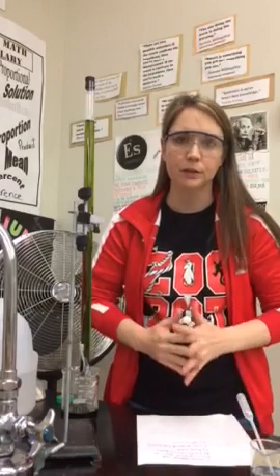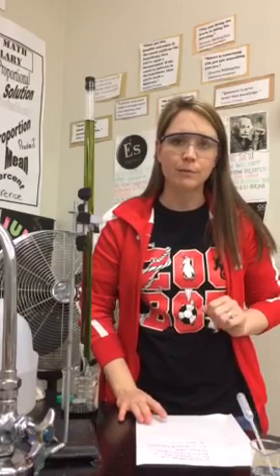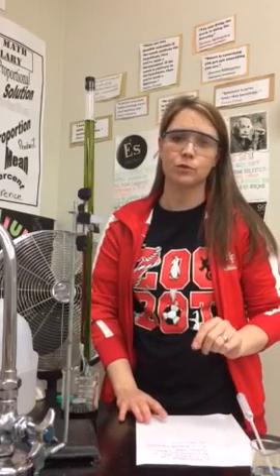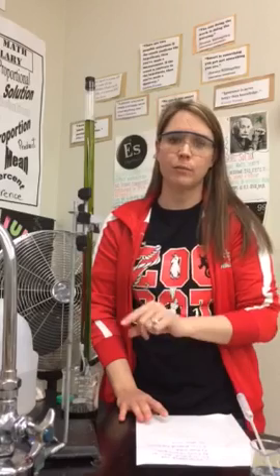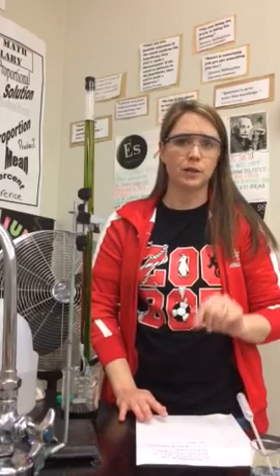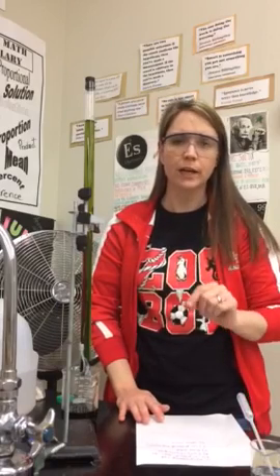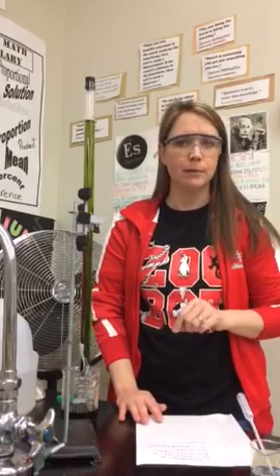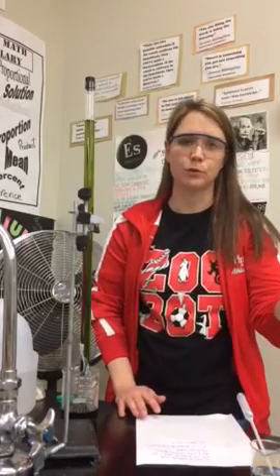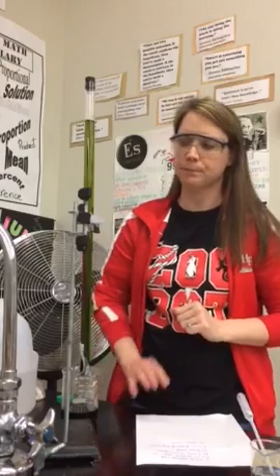You could just do this right in your acid-base packet to jot down the answers right after I ask the questions. And Mr. Goss, I'm not going to give enough time in the video to ask the question and give them time to respond. So please pause the video after each question that I ask before I perform that step of the demo. So title your demo notes acid-base demo, or rainbow tube demo is fine. You can pause it now if you need to give them more time to write.